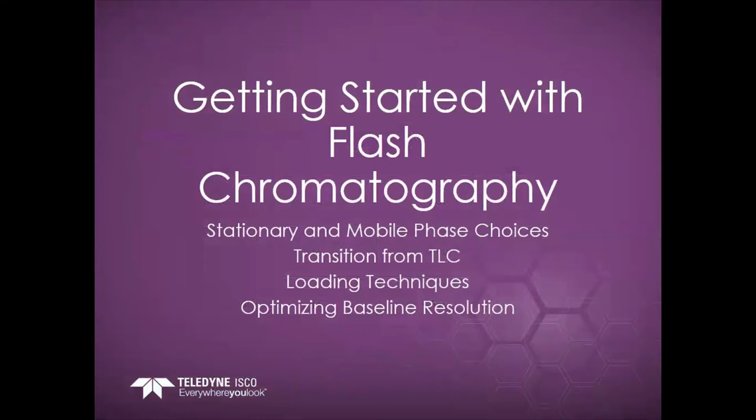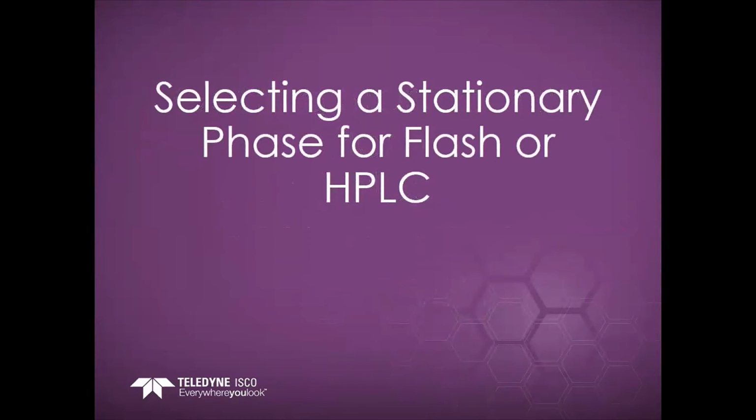So the next topic we want to discuss is getting started with flash chromatography. We're going to discuss the different choices we have in selecting stationary and mobile phases. We're going to discuss how to transition from TLC, different loading techniques to get your samples onto the flash column, and then ultimately how to optimize baseline resolution and improve your separation abilities. So, selecting stationary phases for flash or HPLC.